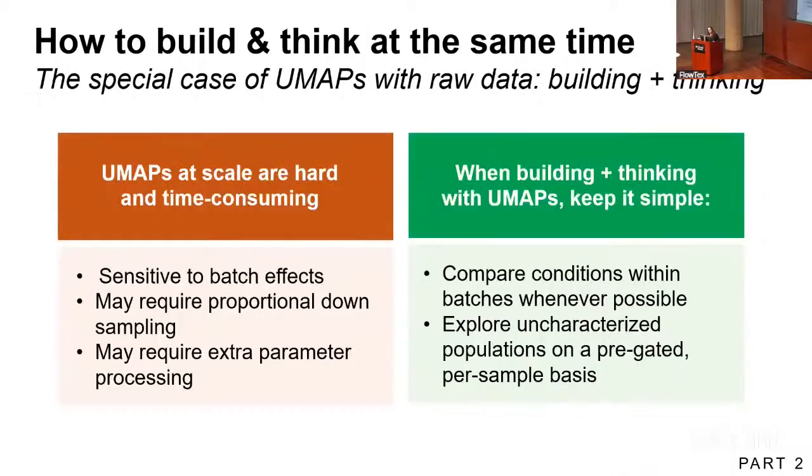And then the special case of building and thinking at the same time is UMAPs with raw data. I have made so many UMAPs that I do feel like I can speak to this with some authority. They are very hard to do well at scale. You have to have even more perfect data than I have already described. They are very sensitive to batch effects.